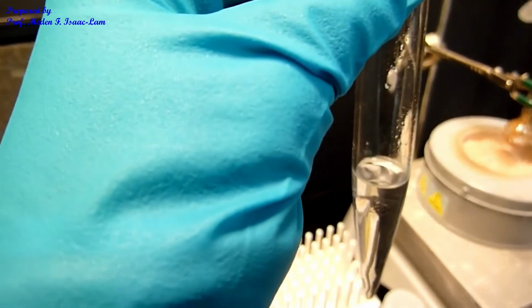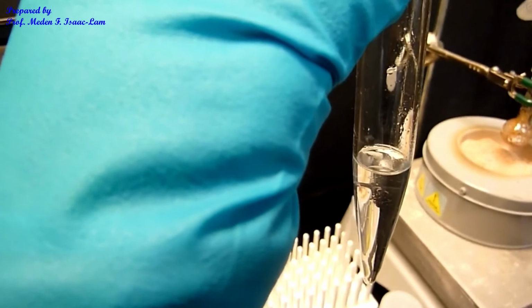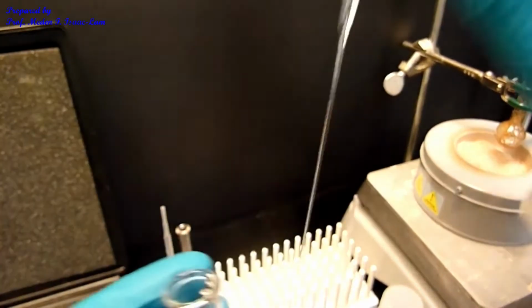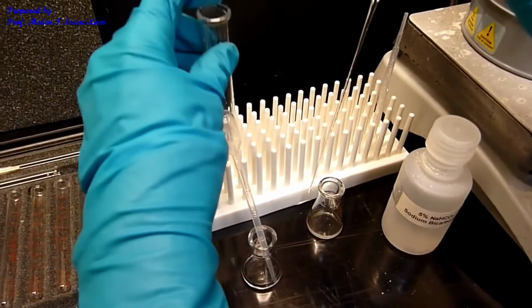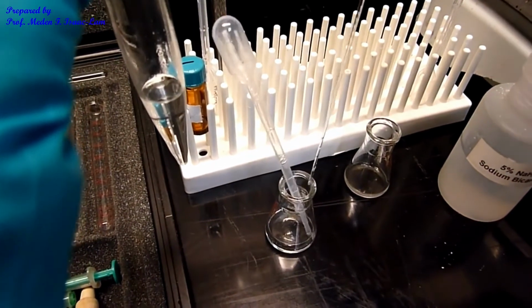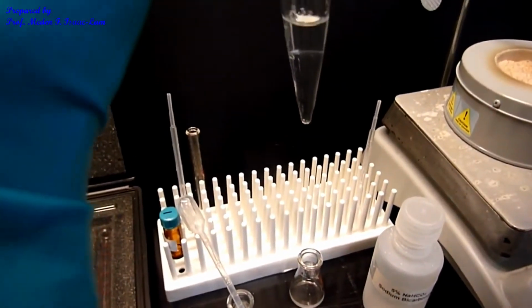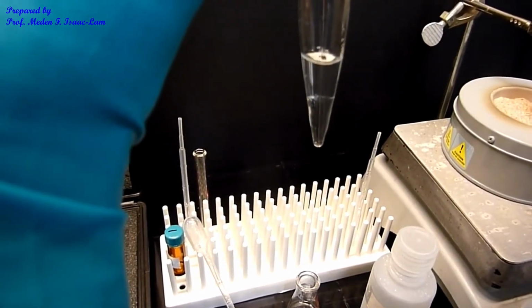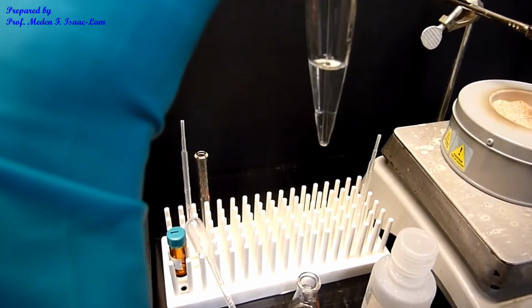If you can see, I press the bulb so that I'm not sucking the upper layer. I want the lower layer out. So I put it all the way down, and I'm now getting rid of the lower layer. So I took that out. It's the same wash as before. And then now I press the bulb, and again I put it all the way down to the bottom of the conical tube, and then I'm getting rid of the lower layer.